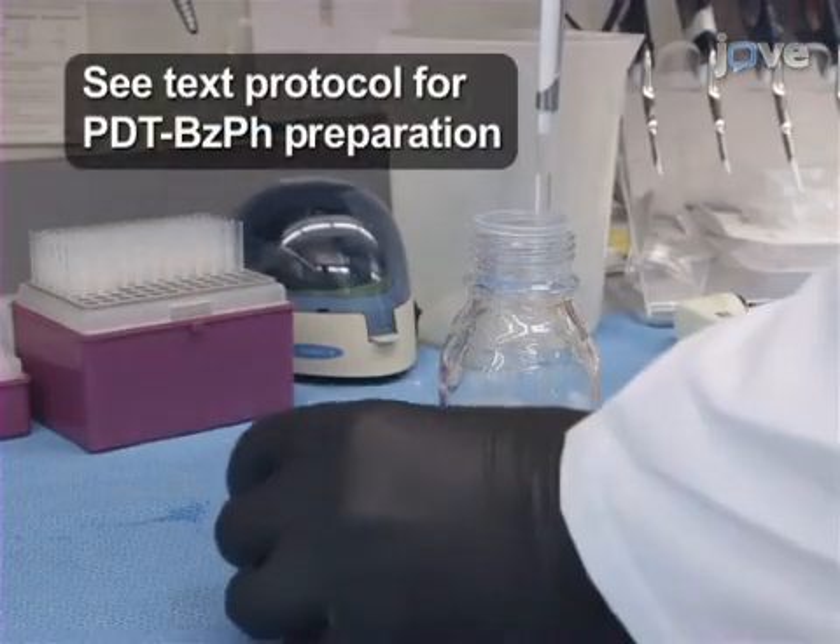Acidify a previously prepared solution of pyridyl-dithiol-benzophenone.